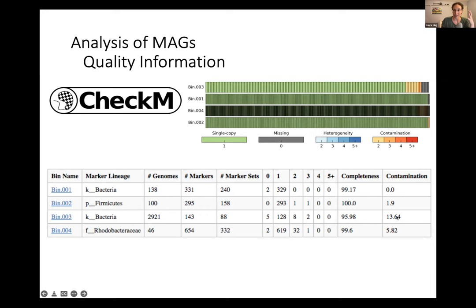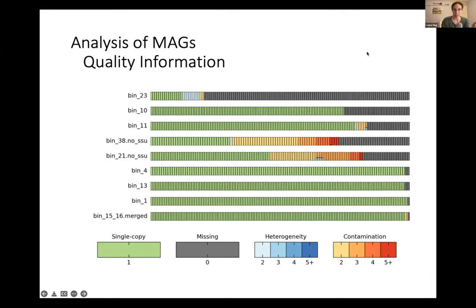Colors mean there are multiple copies when there shouldn't be, gray means genes are absent, and green means they're good. Take a second to look at these and decide which one's the worst bin. You've probably selected bin 23 or bins 38 or 21 as pretty messy.